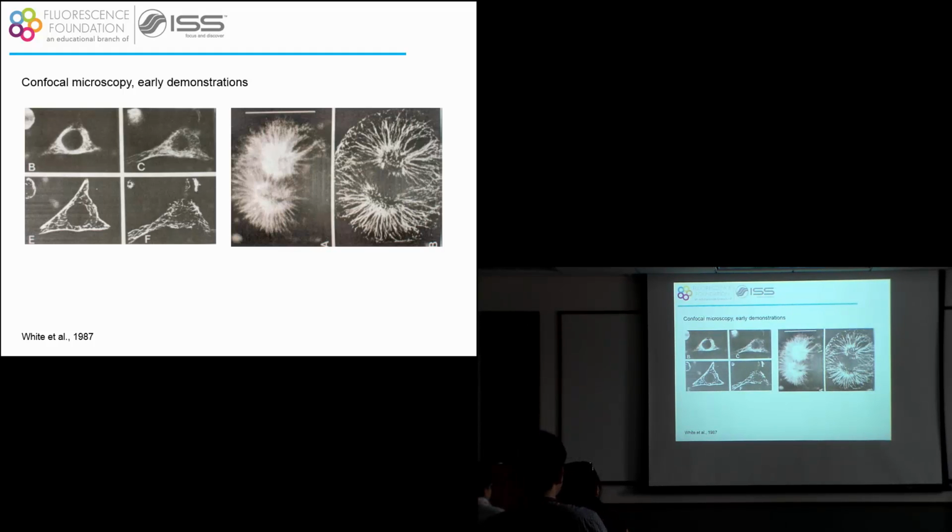You see that, for instance, with a fluorescence microscope, you see this image that is kind of fuzzy, but with the confocal microscope, you see some of the structures with a higher resolution, just because you reject the light that is not at the proper focal length or on the same focal plane as the structure that you want to illuminate.